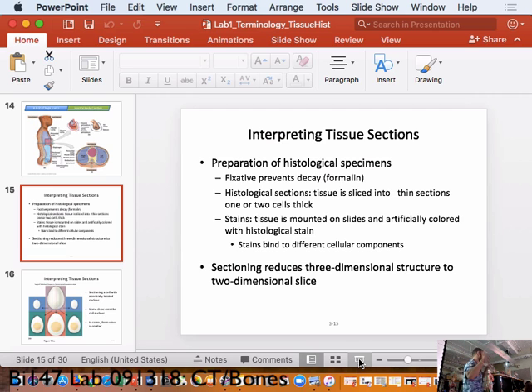Before you put your eyes on the scope, you're going to stand back and dial the scope up, holding that big bar on the right-hand side or the left-hand side. Go all the way to the back on the neck of the scope. You're going to dial the big knob away from you and pull it up.